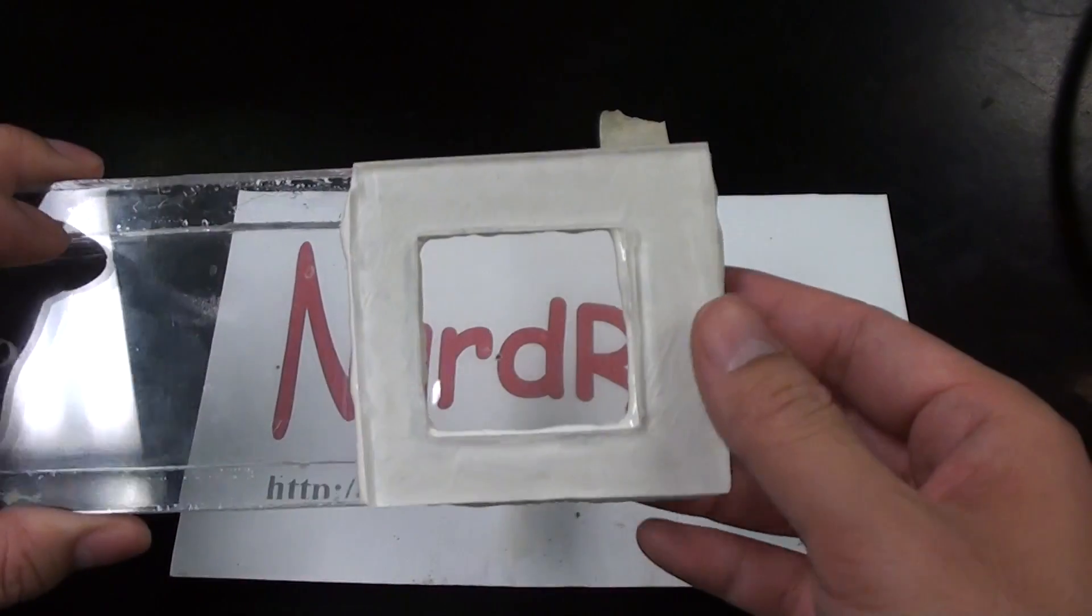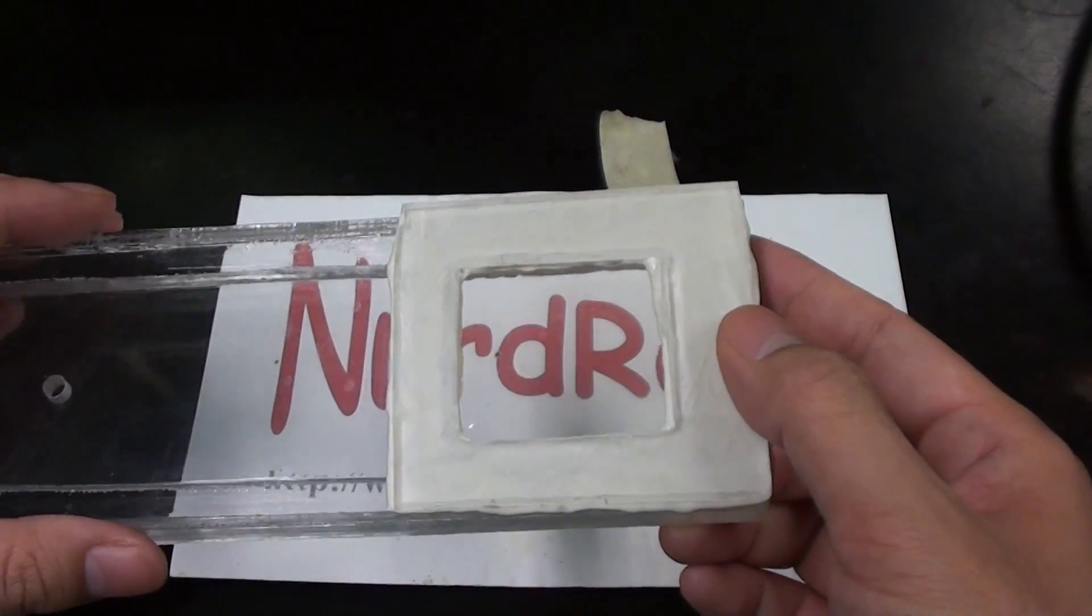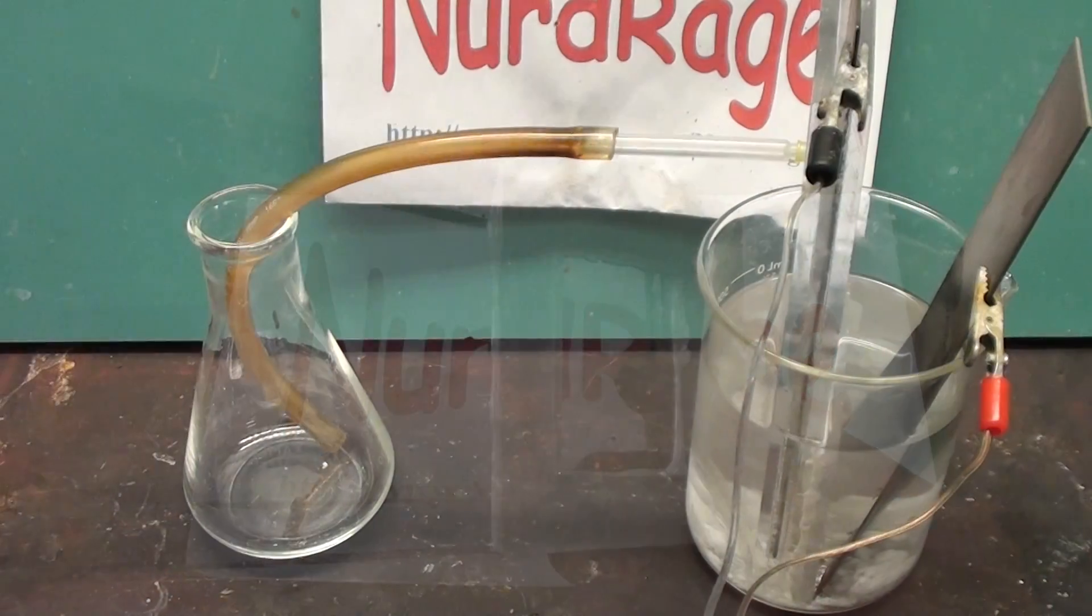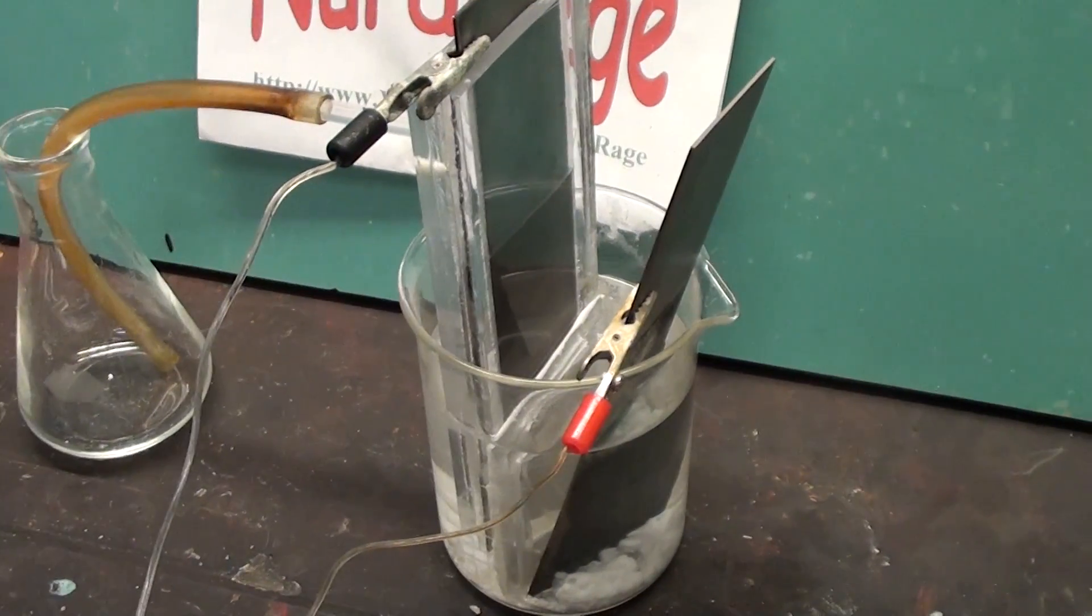Greetings fellow nerds. In a previous video we made a divided membrane cell with nafion, a special type of chemically stable ionic polymer. In this video we're going to use it and make sodium hydroxide out of sodium bicarbonate.